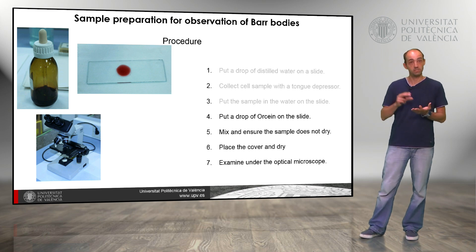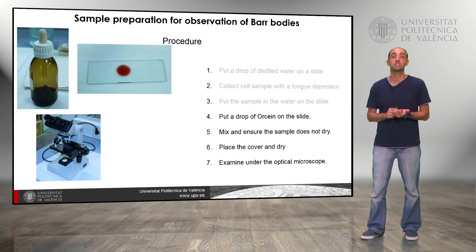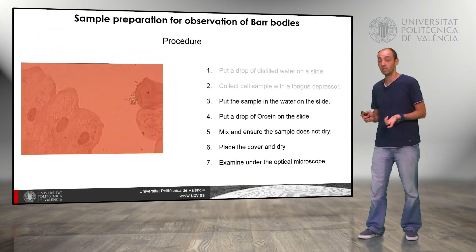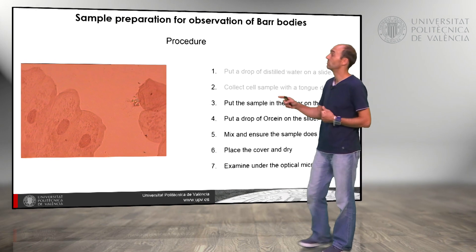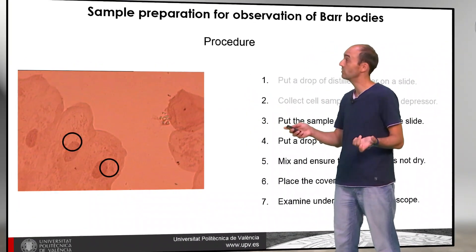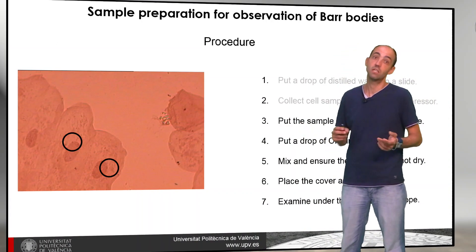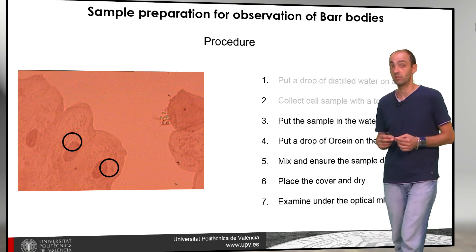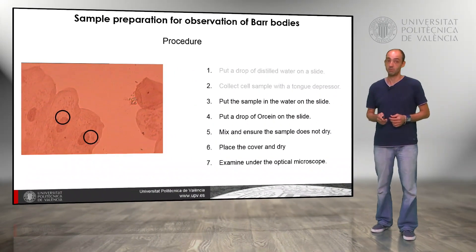After staining, we place the coverslip and dry the preparation, and then we can examine the sample under the optical microscope. Here we have some cells that have been stained, and if we look carefully, we can see the nucleus, and inside the nucleus in some cells we can see the bar bodies. In this case we are talking about a female. If we do not see the bar bodies, we are looking at a male.